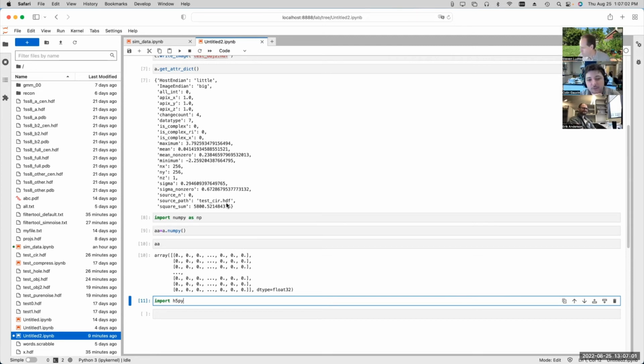So I guess while we're on this topic, I did read the most recent paper you mentioned. I wanted to reread it before I asked these types of questions. It's okay to ask. So how are you saving data off of a microscope right now? Like dose fractionated movies. Well, when you save movies, the data compression stuff that we talk about in that paper is not appropriate for use with raw movies.